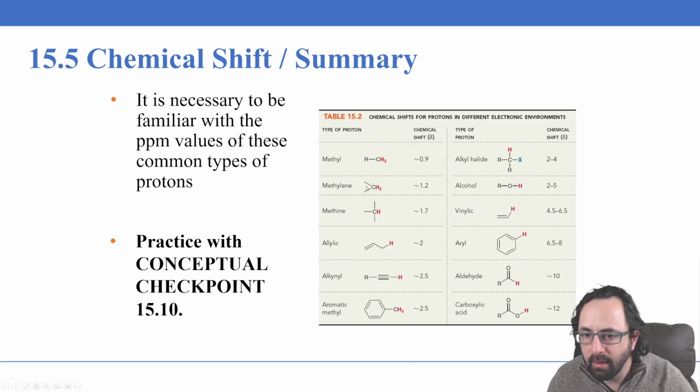The more carbons that you have attached, the more electron density can be distributed and shared and moved away from these hydrogens, thus de-shielding them slightly. The more carbons that are attached, the more of this de-shielding occurs, but it's a relatively mild de-shielding.